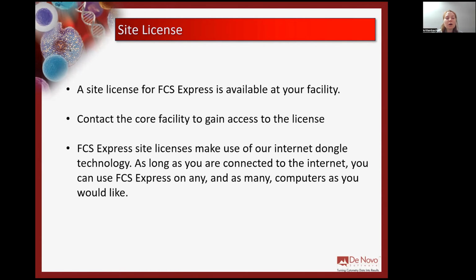And then once you launch FCS Express, you'll see a login screen. And each user is going to have unique credentials. So it'll be like your email address and your personal password. And then when you launch the software on any computer, you can go in and log in and use the software. And the great thing about the site license is that even though there are many people on the site license, every person can just log into the software and use it at any time they want, even if somebody else on the site license is currently using the software. So it's really flexible, and it gives you the ability to log on and do your analysis whenever and wherever you want.